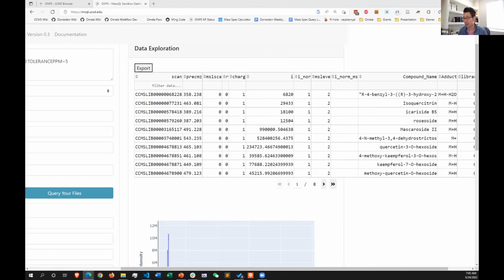So some of them are flavonoids, but a lot of them are from plants. And so with a lot of plant molecules, what do you usually see attached to them? Again, it'll feel obvious and it'll feel ridiculous for me to ask, but I just want you guys to take that leap right there. Right, there's a glycan on a lot of these molecules.